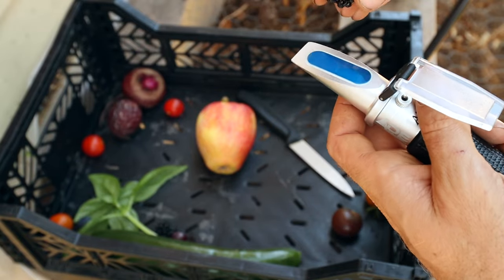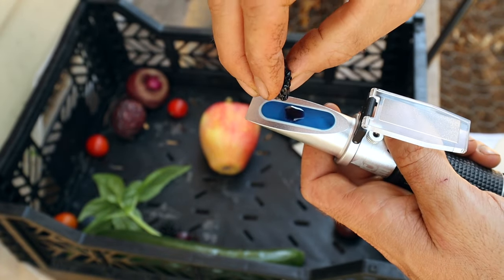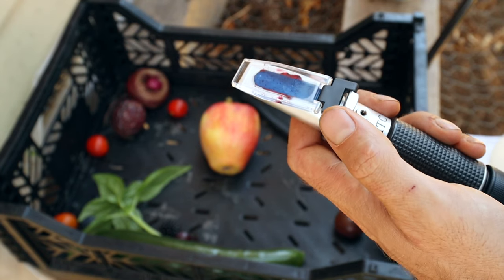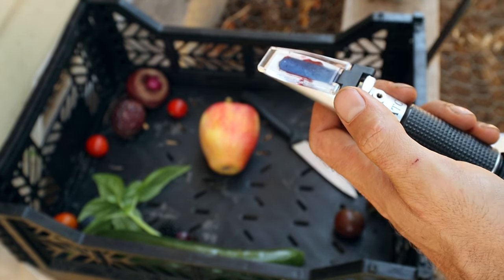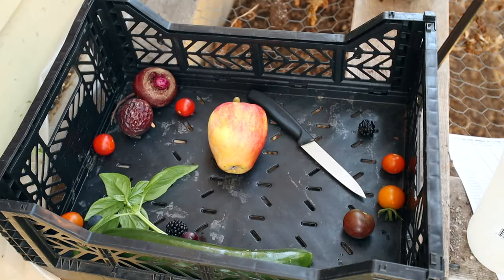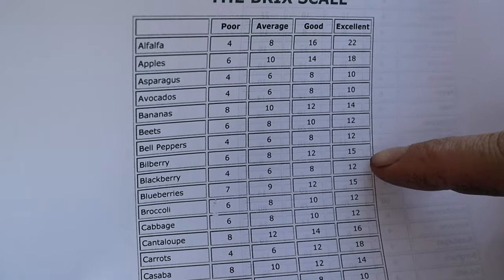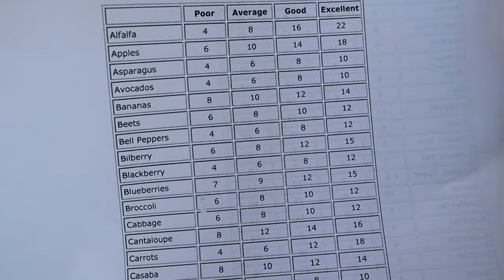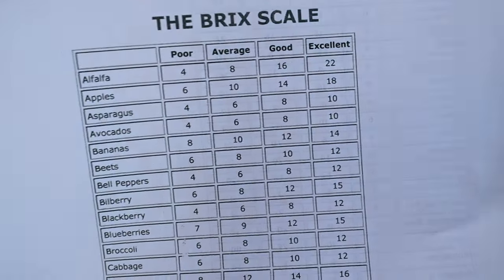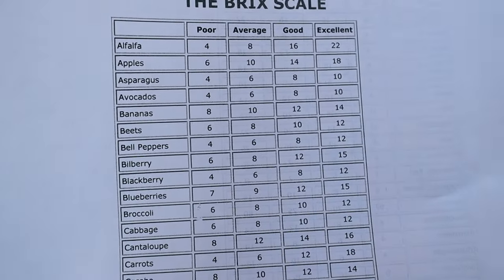Now let's do our first piece of fruit — a blackberry. You only need one or two drops of juice on there. Close the viewing window and let's see what we got — it's measured at where the blue and the white lines meet. According to the chart, my blackberries are off the scale! Excellent is 12, and mine are 15 — so the sugar, vitamin, and mineral content is far exceeding what they consider to be an excellent blackberry. Those were super ripe as well.